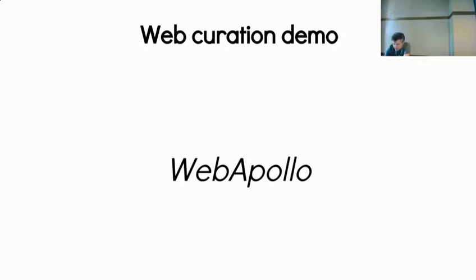Oh, I did the longer one, not the shorter one. You just changed the location to extend it. Yeah, in this case I'm just extending the feature, but I'm syncing into the wrong place here. That's a problem when you're zoomed in as much as I am. You can see that they're switched apart here. Oh, and this is the exon here. So there we go, you can see it changing there.